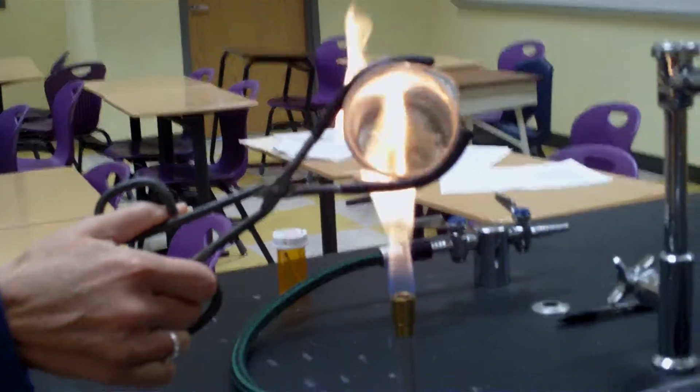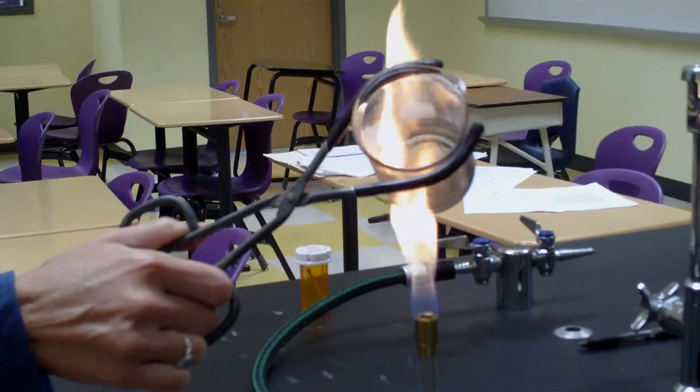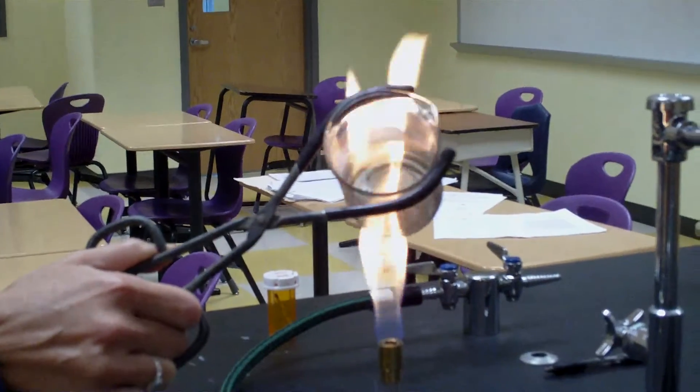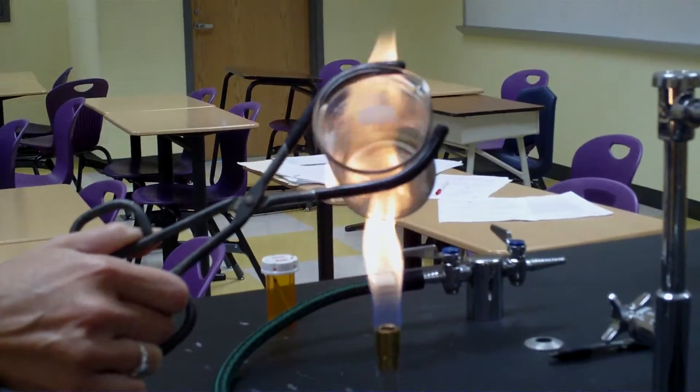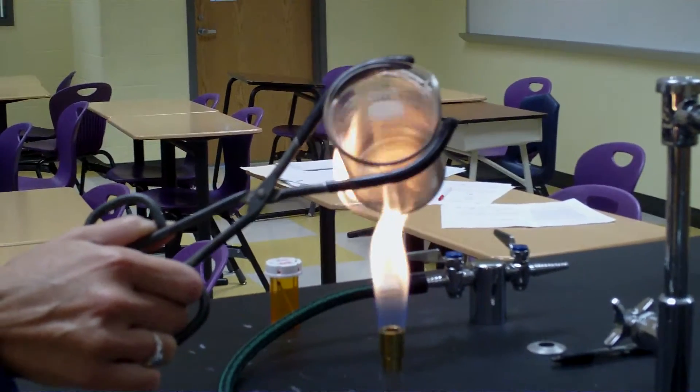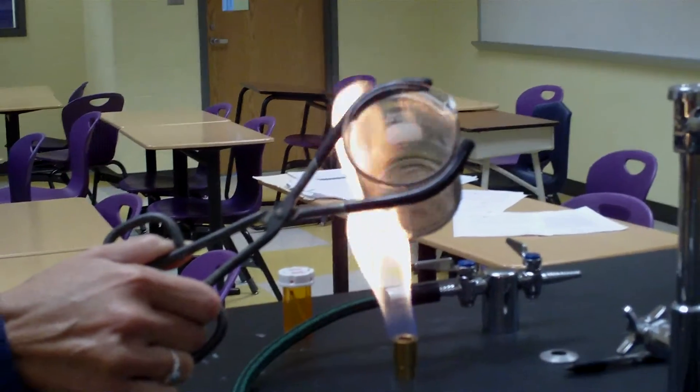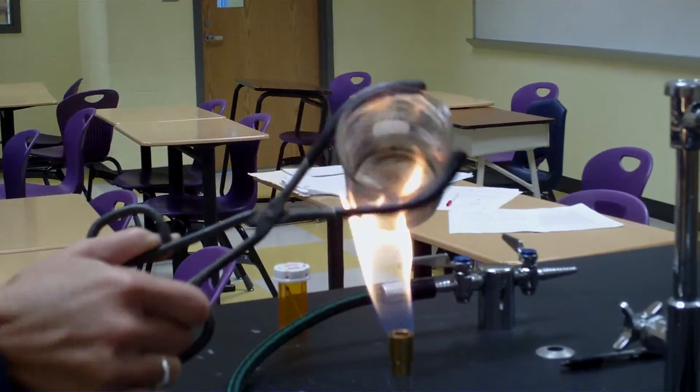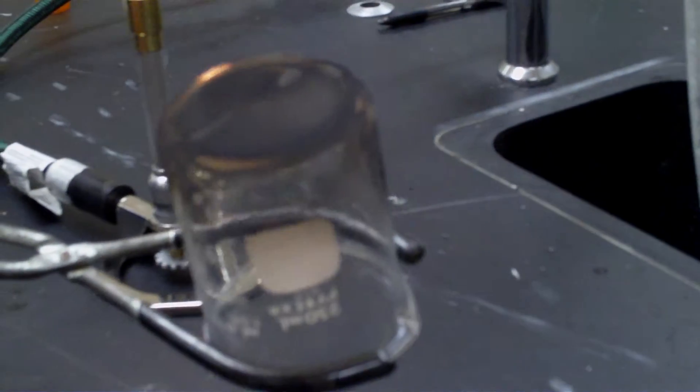Use beaker tongs to hold the beaker in the flame. You can see a black substance forming on the bottom.